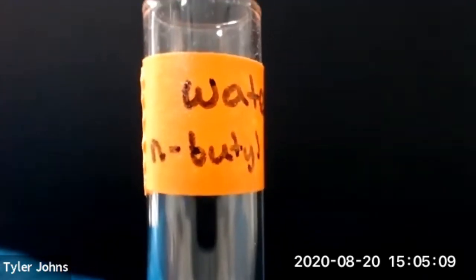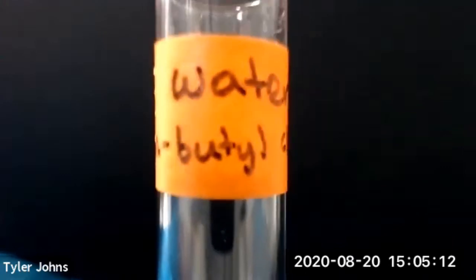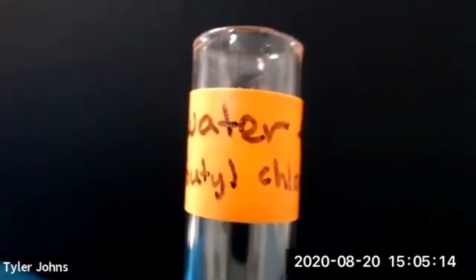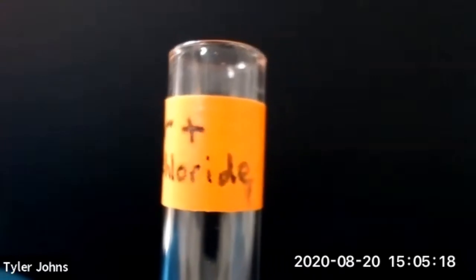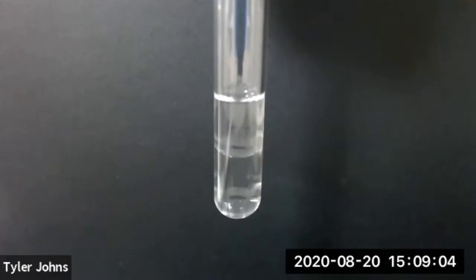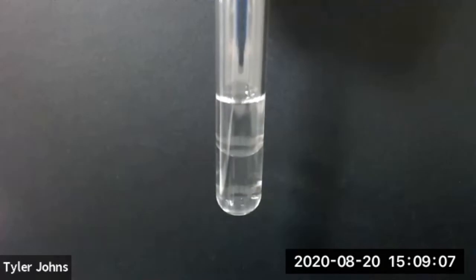The first pair of liquids contains water and n-butyl chloride. We'll now add several drops of water to our test tube containing water and n-butyl chloride.